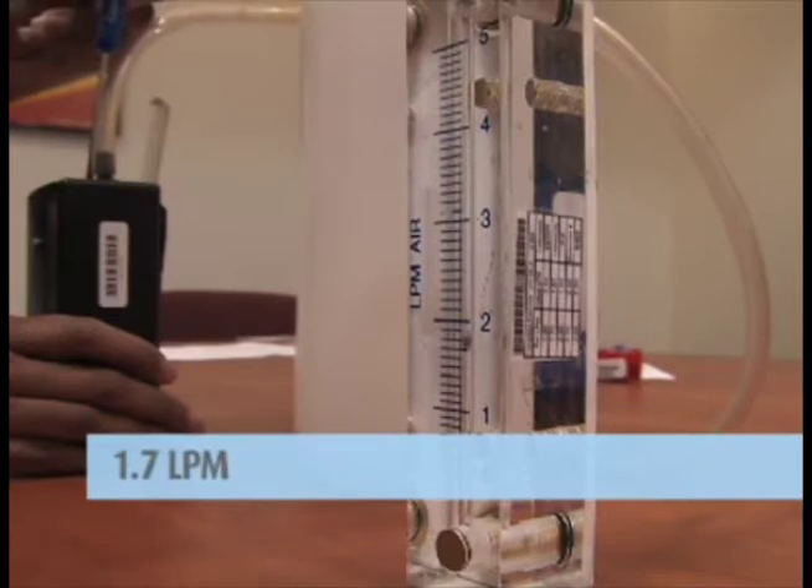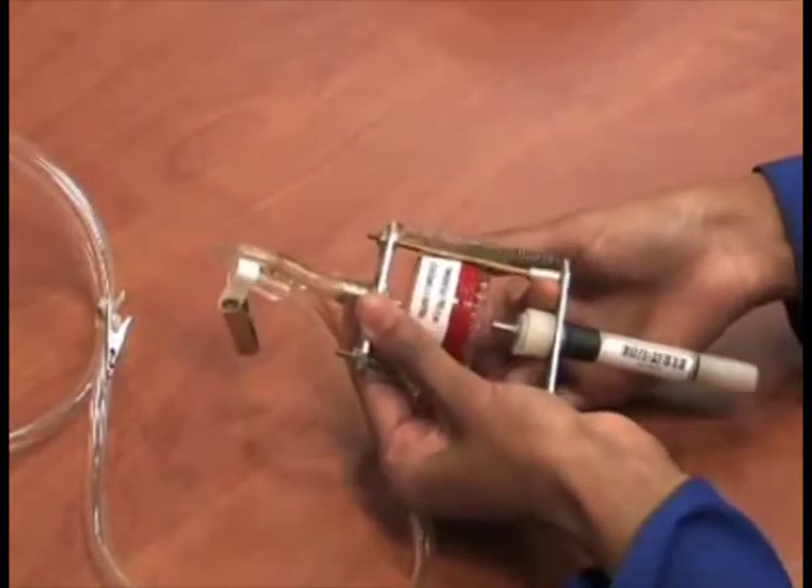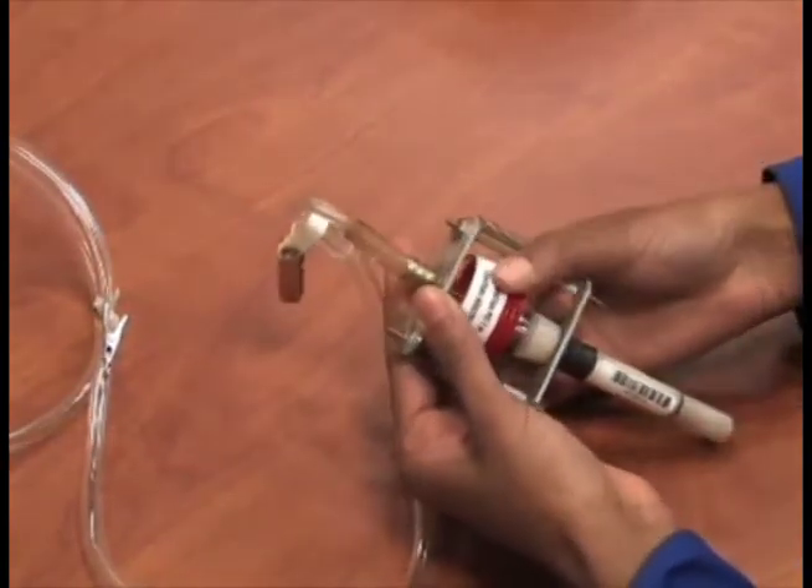The required flow rate range for respirable or silica sampling is 1.7 liters per minute. Verify the flow rate against the pump calibration data sheet. Add a new sampling cassette to the Cyclone holder you will use for field monitoring.